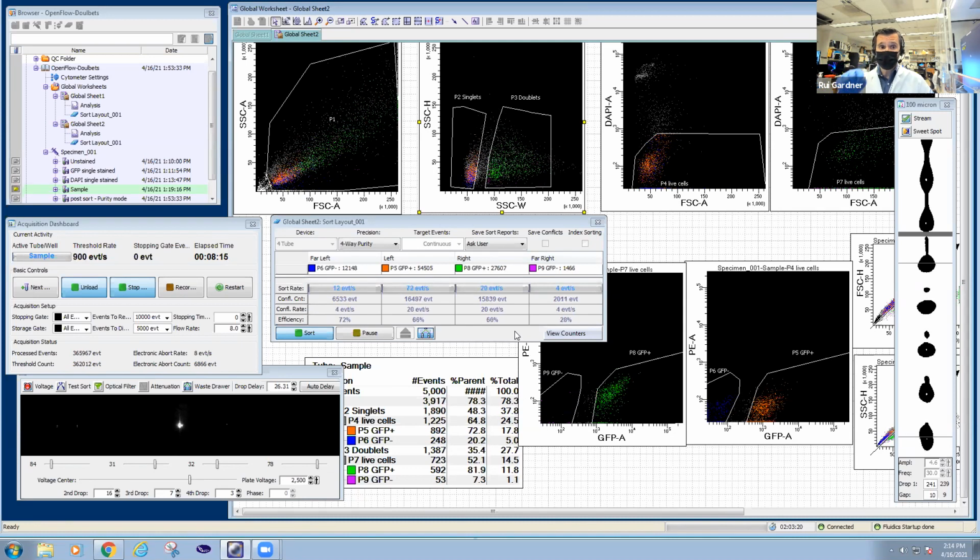Actually, that brings me to another question somebody asked me the other day. They were looking at the recorded sample and said, I don't see any problems during the sort. Just to remind everyone that when we record, we actually just record a little bit of the sample, but we're not recording during the sort. So while it's sorting, we're not seeing if there's any problem with fluidics, unless we are recording it throughout the whole sorting process.